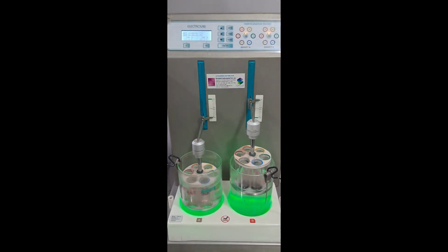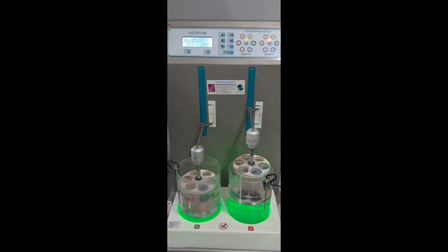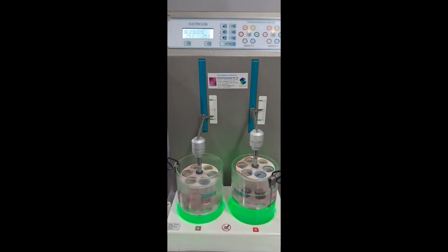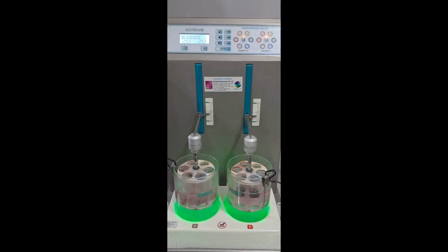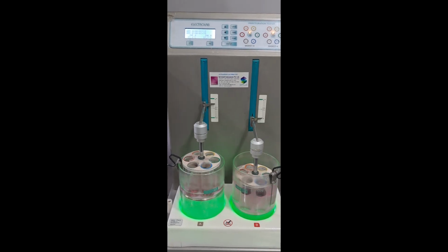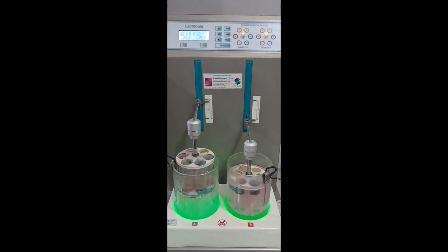3. Stroke rate and length accuracy. Calibrate and log actual strokes per minute. Mechanical drift can creep in over time. Measure actual vertical travel. Undershoot weakens agitation. Overshoot may damage samples. 4. Basket rack and tube integrity. Inspect tubes and mesh for corrosion, warping or mesh tears.